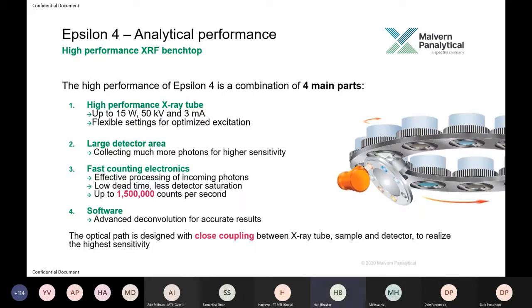And also when you're looking at press powders with separate analytes such as saprolite and limonite with their different mineralogy, it means that you can have improved performance on your individual sample types because those conditions are optimized to the material rather than having a general purpose calibration that is trying to achieve everything. So that feature means that you can deliver more accurate and more precise results on the materials that you're analysing.